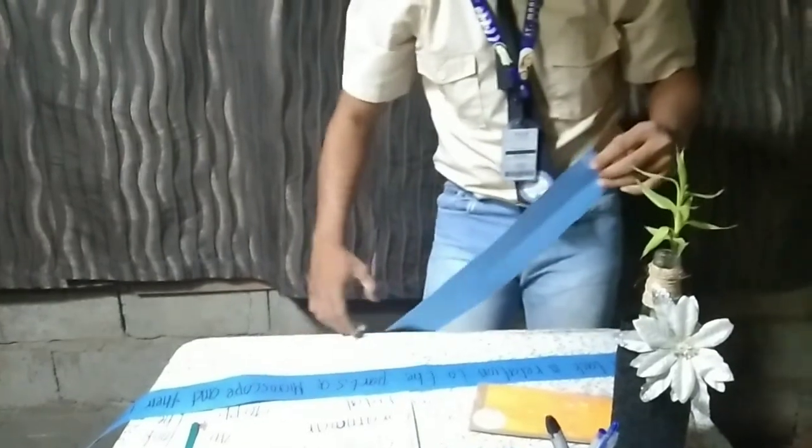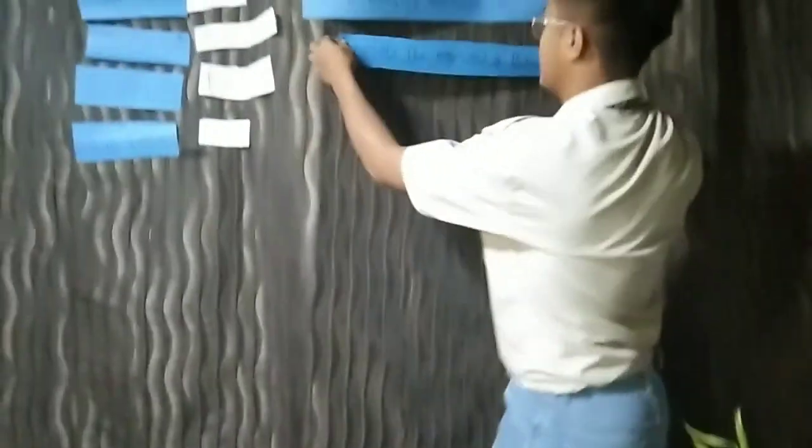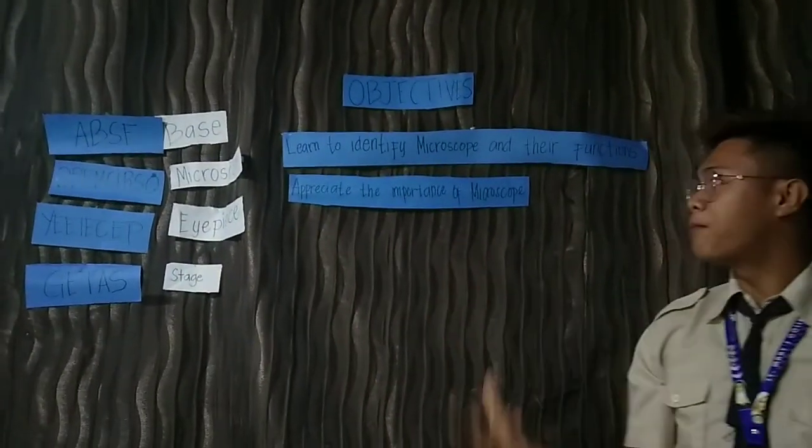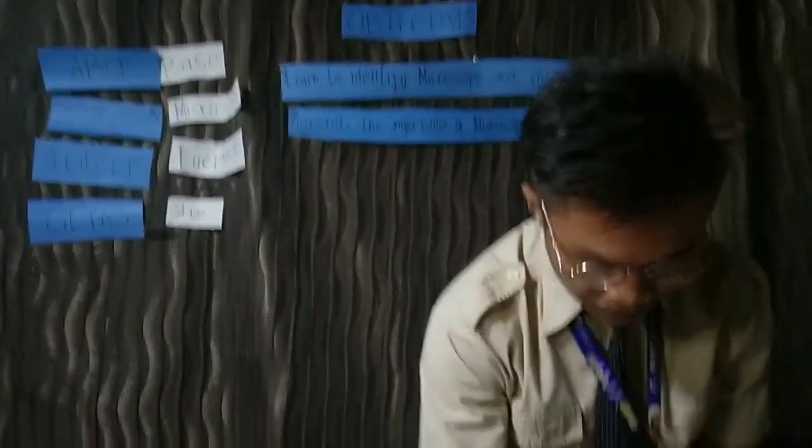Second objective is to appreciate the importance of the microscope.